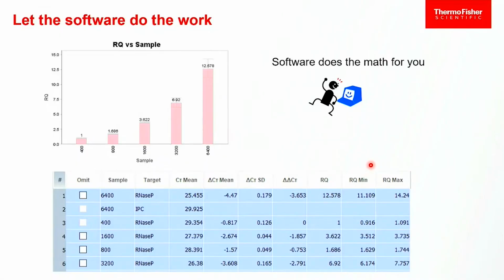Just a reminder, this is a twofold growth process, so your error bars are going to be asymmetrical. Okay. It also means trying to execute this in Excel correctly can be difficult, because it's logarithmic. Yes?